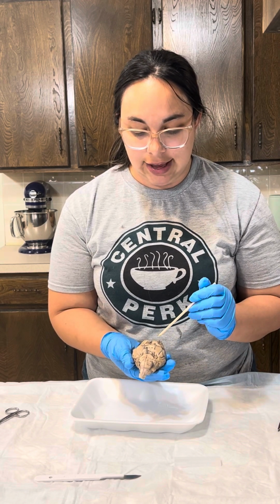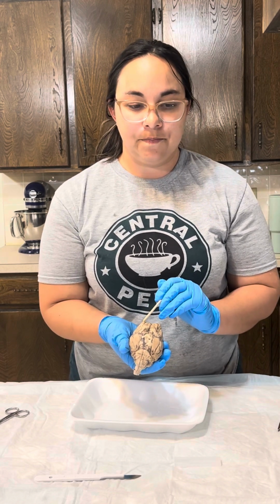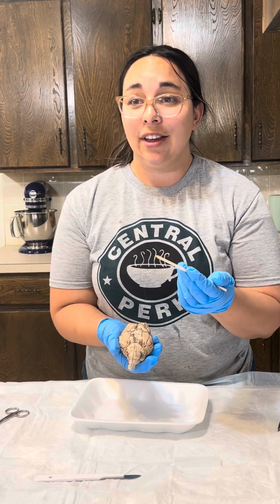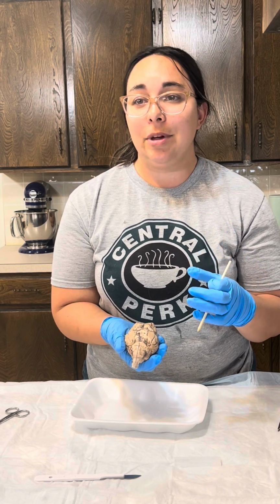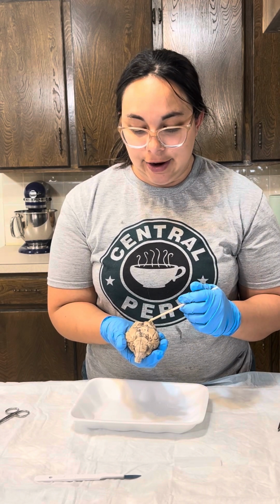But on the back here, what you can also see is we have the olfactory lobes right here. So that's where you smell. On a sheep, they're actually bigger than on a human because, as you can imagine, a sheep's smell is part of their survival. But that's what that is right there.